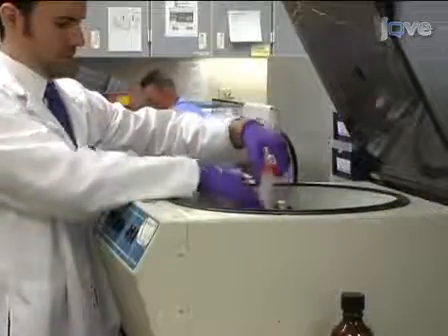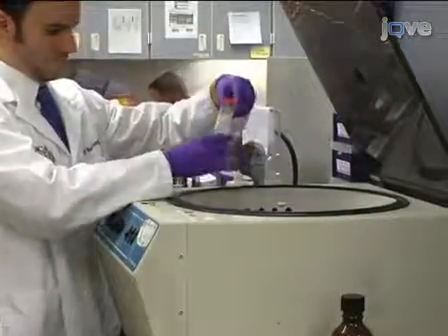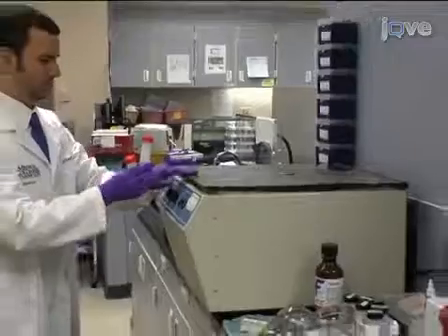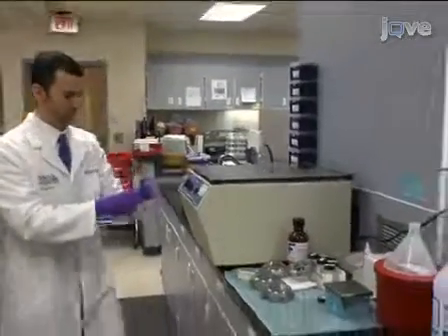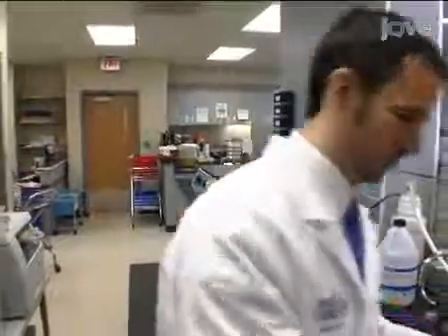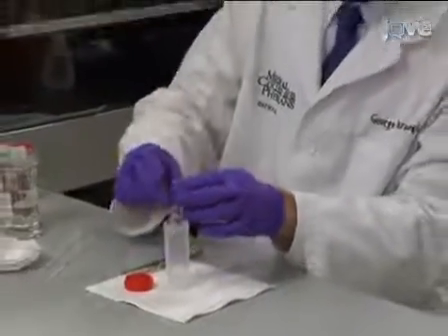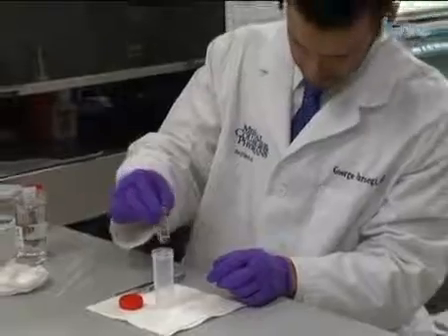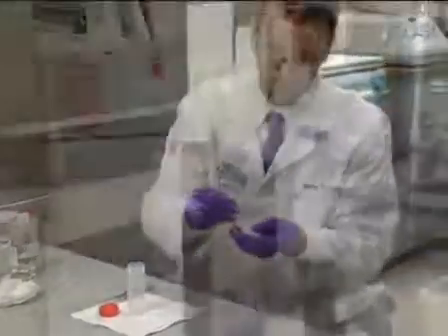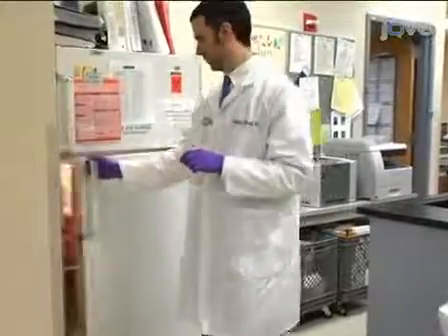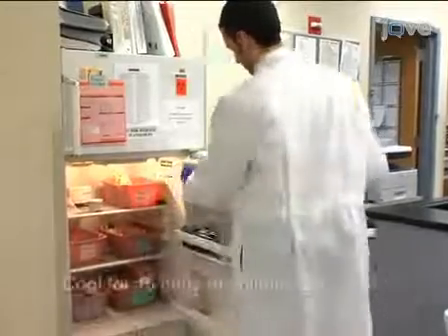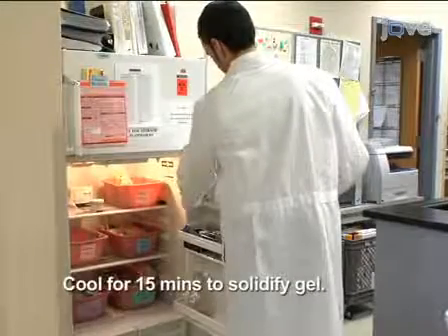When the centrifugation is complete, remove the tubes gently and vertically from the centrifuge, taking care not to disturb the thin sediment layer of cells at the bottom. Using forceps, remove the smaller glass tube vertically without disturbing the sediment layer of specimen cells. Finally, refrigerate the small glass tube in a vertical position for 15 minutes to cool and solidify the gel.